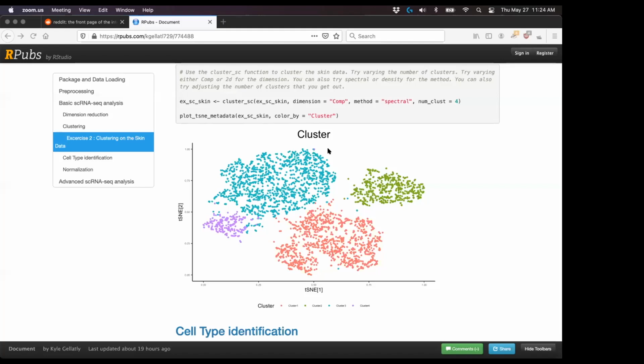So I believe I'm sharing my screen again. You guys probably did your own specific clustering. I don't see your screen. Oh, you don't? Okay, I don't know what happens. Oh, I see. I turned on video, not screen sharing.